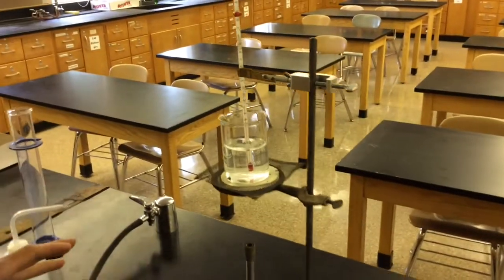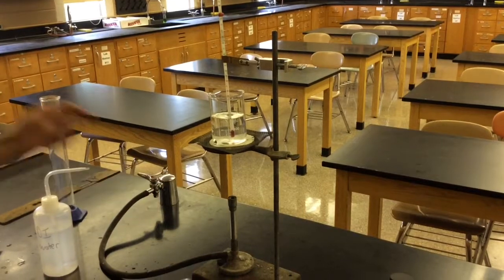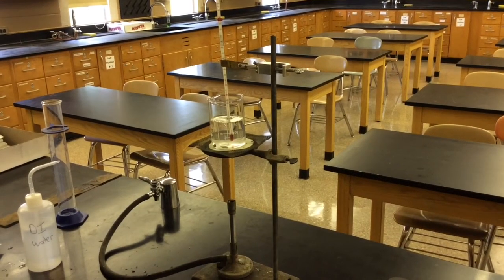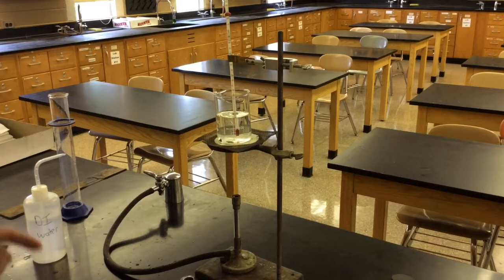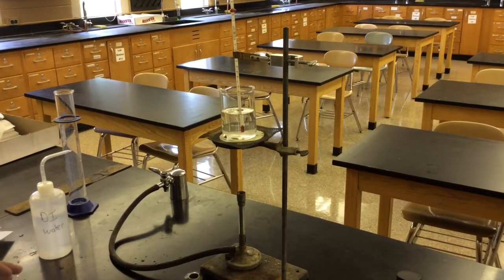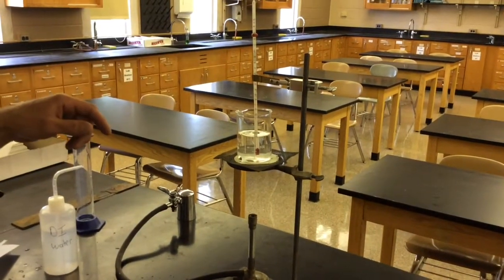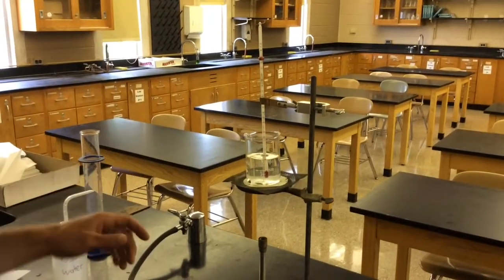All right, so this first run, we are just doing pure water. At this point, you can turn on the Bunsen burner and start heating this. You do not start timing it until the water starts to boil. Then what you do is every minute you write down the temperature for 5 minutes. So your temperatures on your data table, you shouldn't start writing anything down until you're around 100 degrees Celsius. It might be slightly above or slightly below because our thermometers are not real accurate, but it should be around 100 degrees, and then just write it down for every minute.